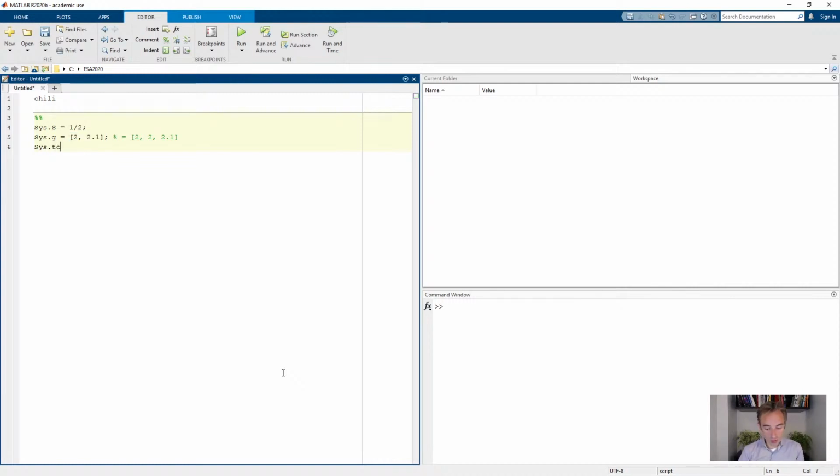Okay, now the new parameter is the correlation time, tcorr. This time tells you the time scale on which the molecule tumbles. So basically, let's actually write this down. Let's take 0.1 nanoseconds. So 0.1 times 10 to the -9 seconds. What does this mean? That's 100 picoseconds, right?